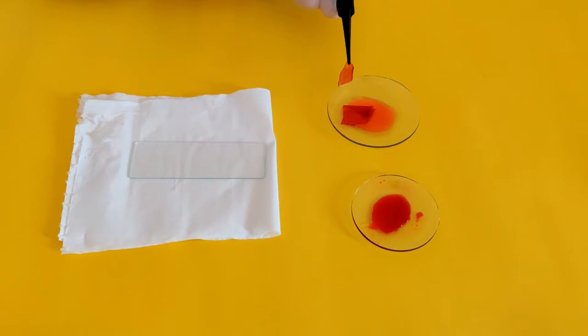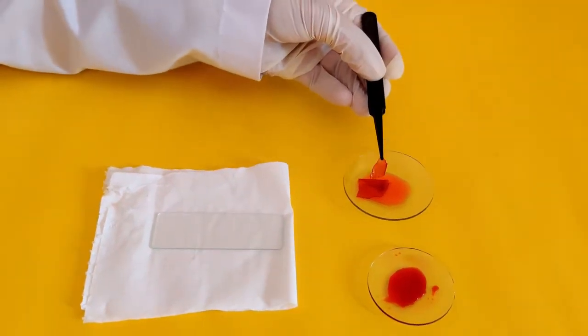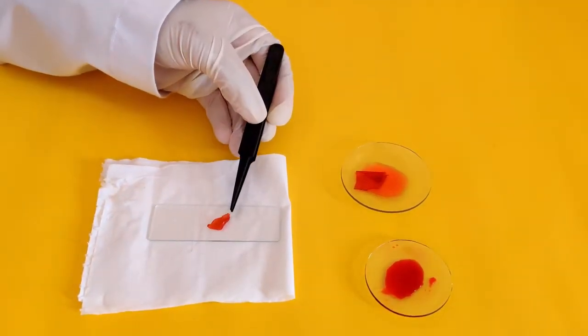Cut out a small piece of the stained tissue using scissors and carefully place it on the glass slide.